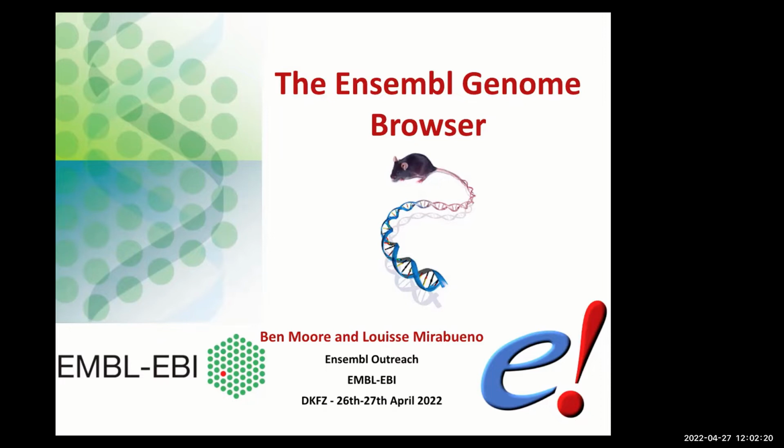Okay, so it's just a few minutes past 1, so I think it's a good time to start. There might be a few more people to join as we start the course today, but we want to make sure that we have time to go through everything. So as I said, welcome back to the Ensembl Genome Browser Workshop. This is our final day together, and Louise and I will be going through the final modules, looking at some of the different data types that we have available in the Ensembl Genome Browser.